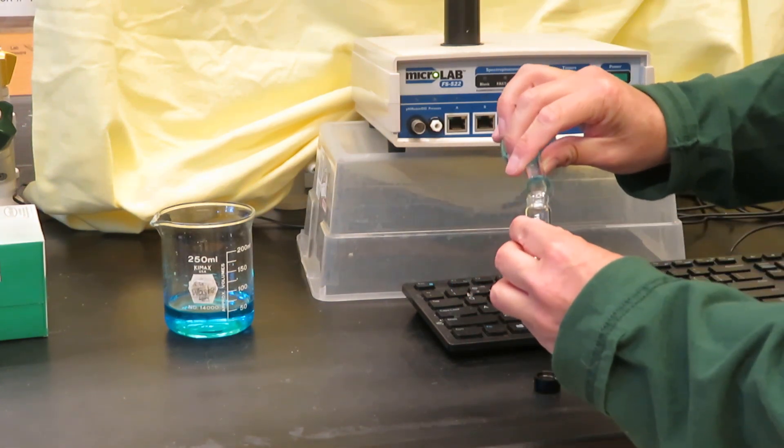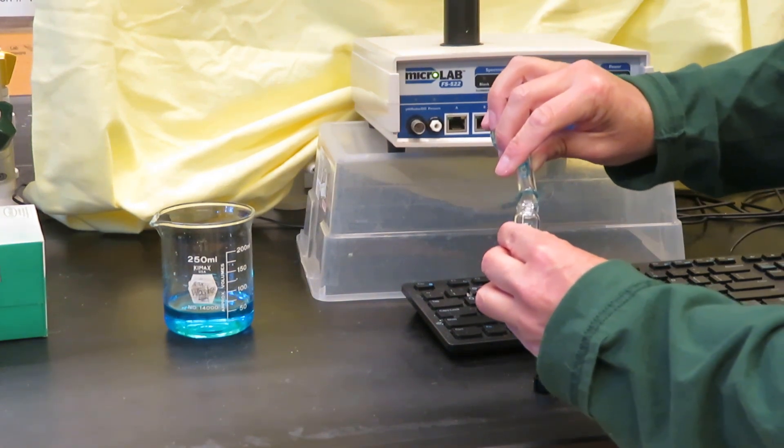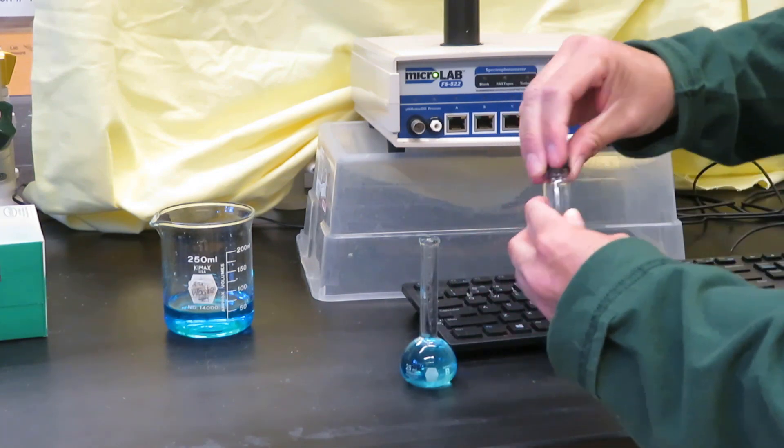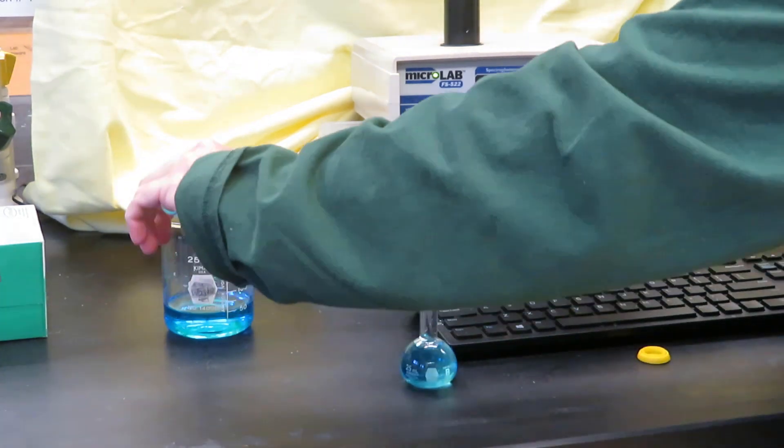There could be some surface tension, so I tap it just a little bit. We want to condition the vial and pour into our waste beaker.